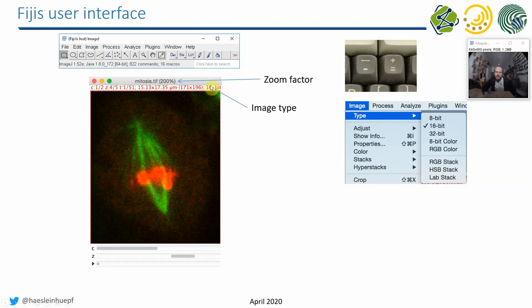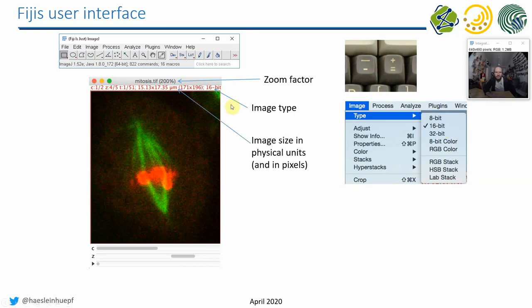You also see the image type — for example, a 16-bit image — and you can change it in the Image menu. When converting from 16 to 8-bit, you have information loss. For image subtraction, 32-bit is strongly recommended because 32-bit images allow negative values, while 8 and 16-bit do not. You can also see the physical size of the image in microns, the pixel dimensions in X and Y, the current channel (C), slice position, and the time point.